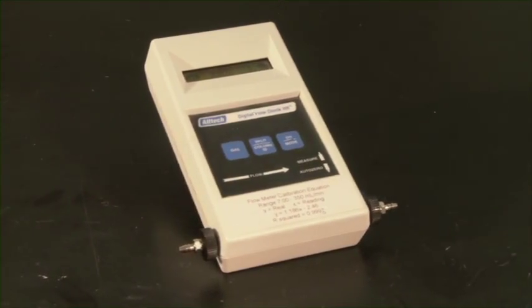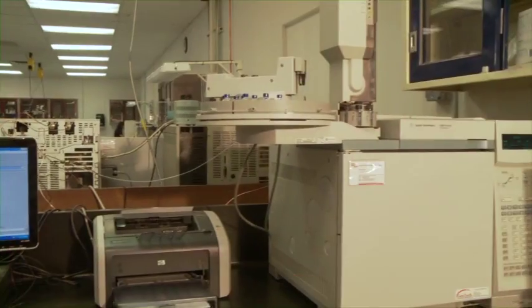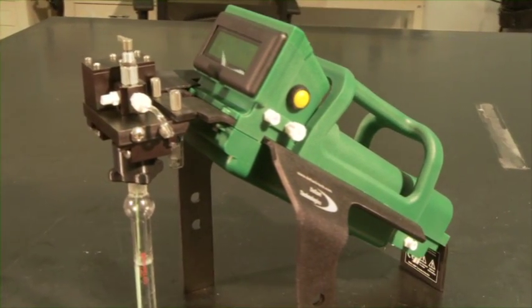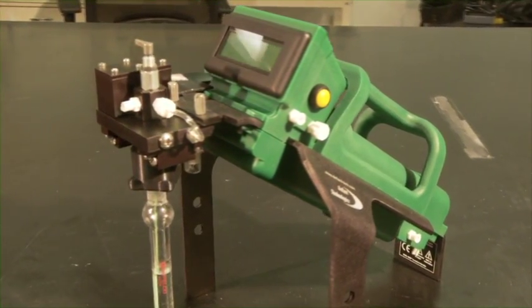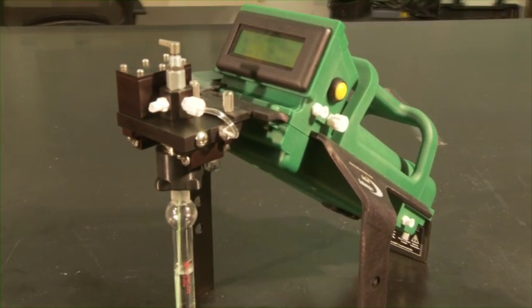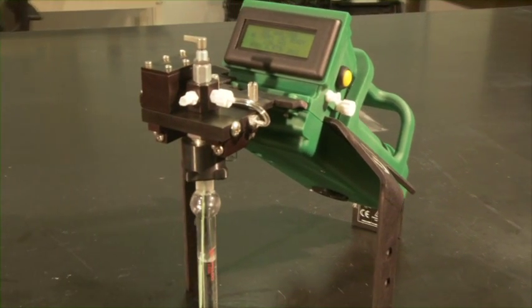All lab instruments need to be calibrated to ensure the accuracy of their results. In this video we will demystify calibration and describe the process in simple steps for the Frog 4000 chemical analysis instrument.